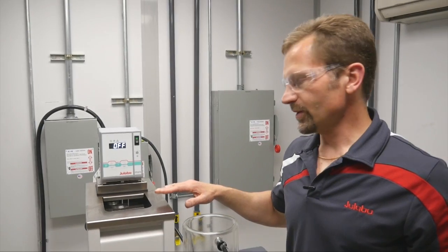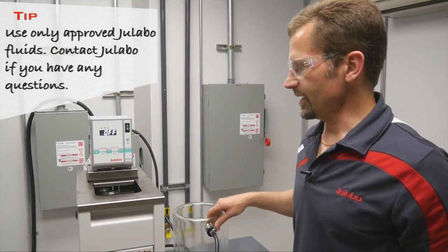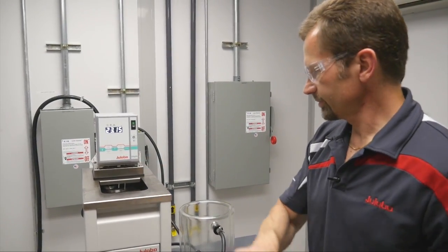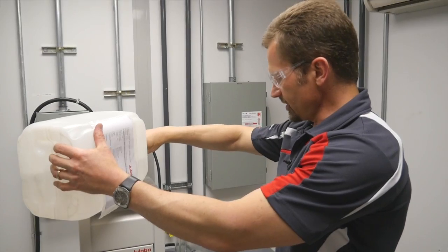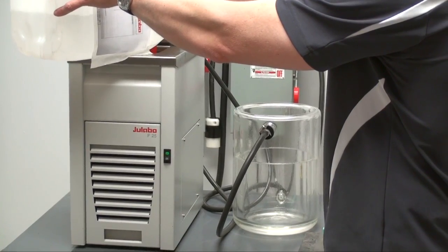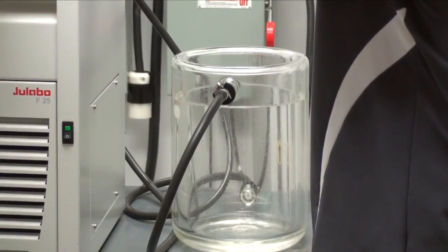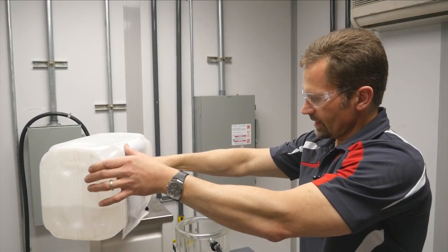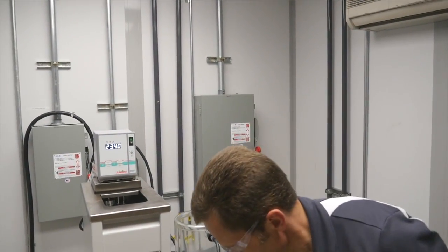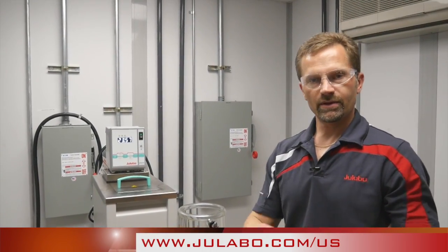Now that the ULABO internal bath tank is filled, we need to circulate to fill the flow path for the external application. Simply turn on the pump and as the external application fills up, add more fluid. And now your application is ready to run with your new bath fluid.